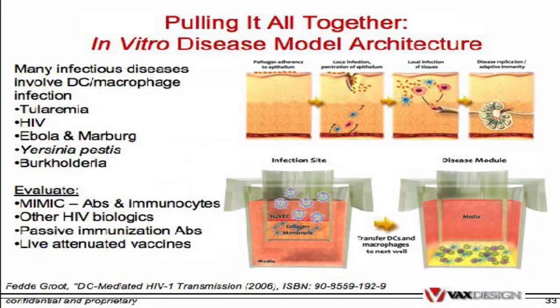We see how the PTE, or the peripheral tissue equivalent module, dendritic cells process this material and pass it along to the lymphoid tissue equivalent module. We can also test the product of the LTE or the PTE modules in a functional assay and determine if these antibodies or T cells are functional.